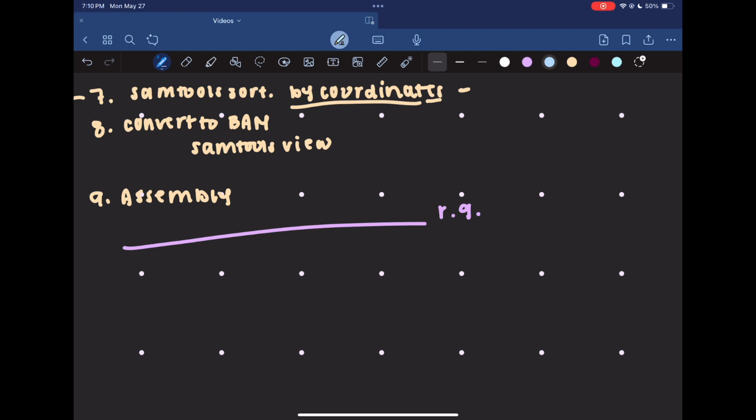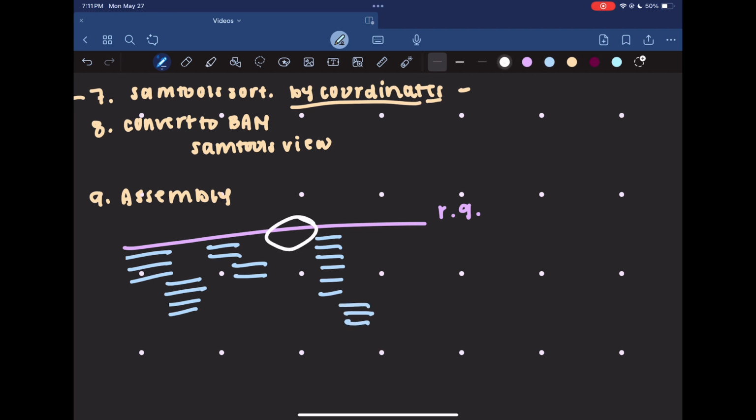When I align, I just take my individual reads and place them where they match along this stretch of sequence. Hopefully I don't have a lot of big gaps unless there are actual gaps in the transcriptome, but it's impossible to know if a gap like this is because I just didn't happen to get a read that placed there properly, or if this is actually a gap where we would not see RNA being transcribed.